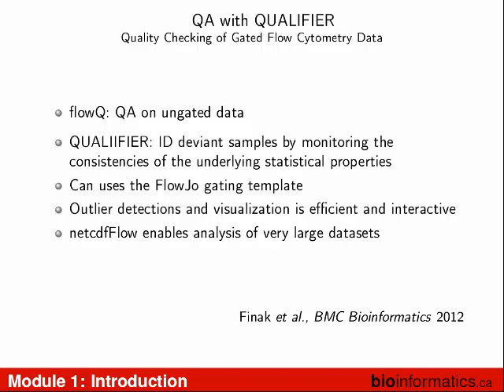Just a question about that last slide. Since you talked about being able to pull in FlowJo templates, where is the technology at right now to pull in a DIVA experiment? So the question is, we can read in FlowJo, can we read in other technologies?